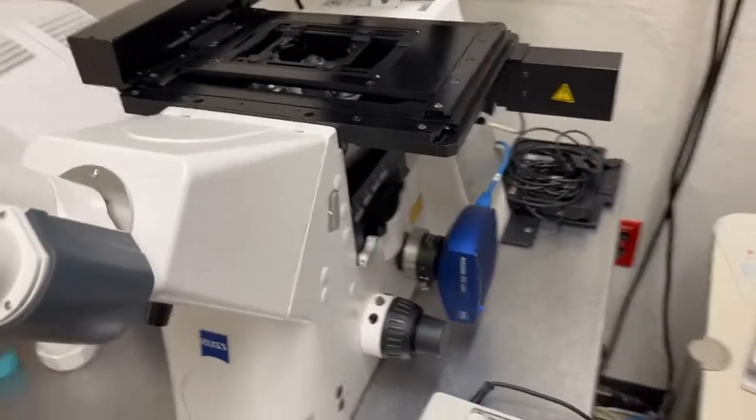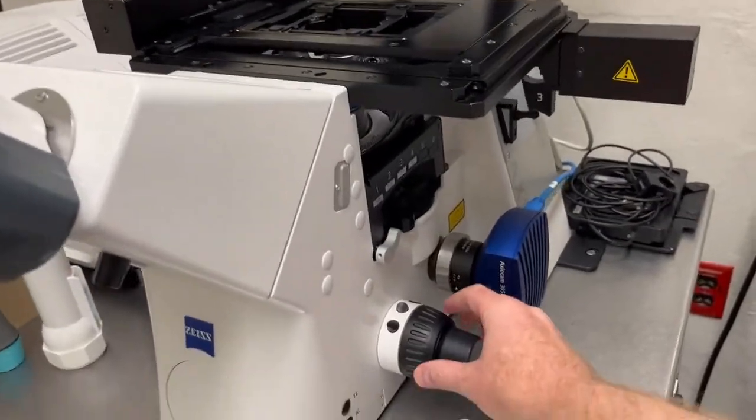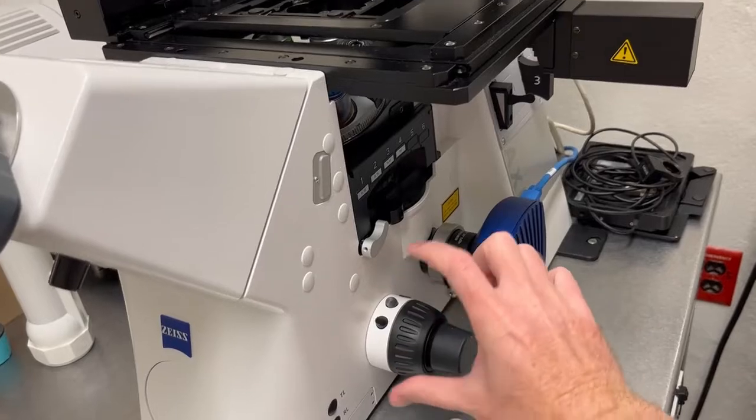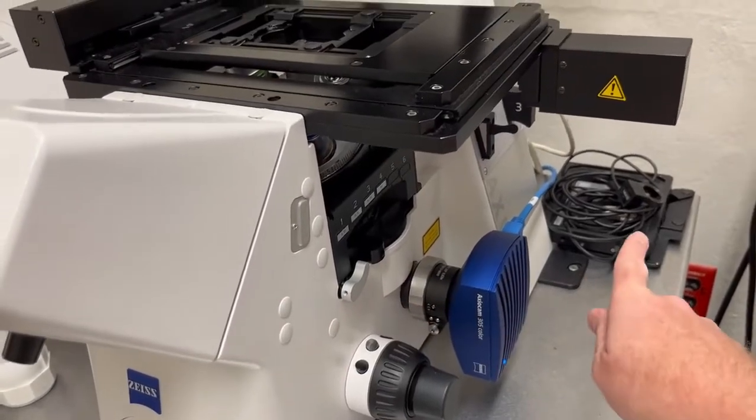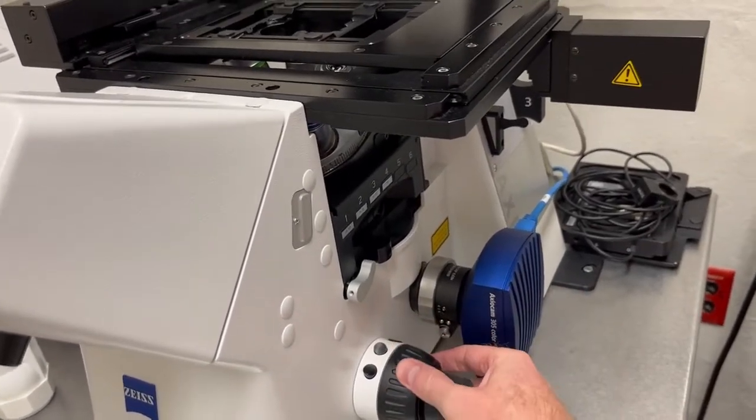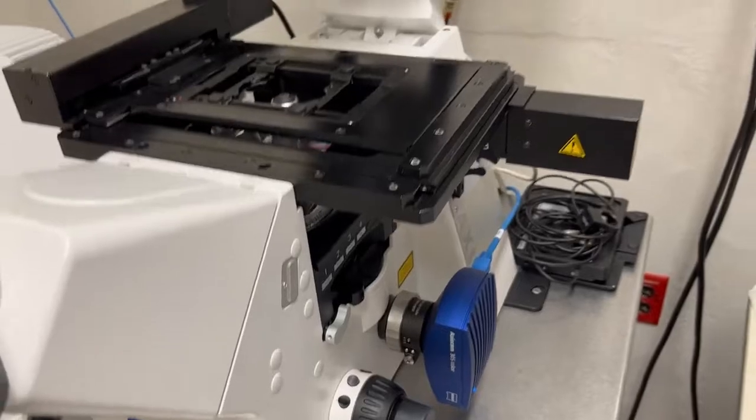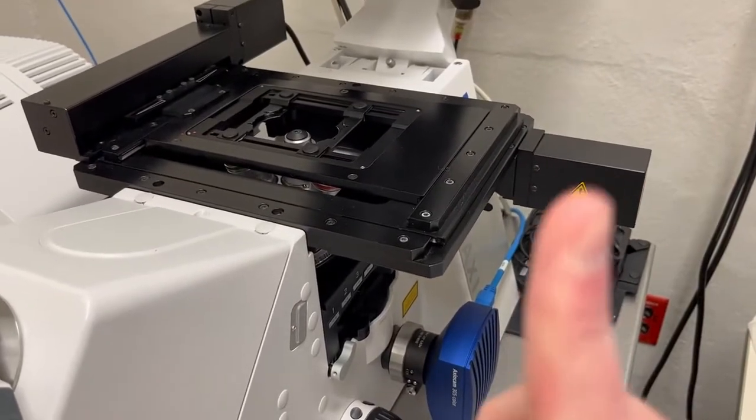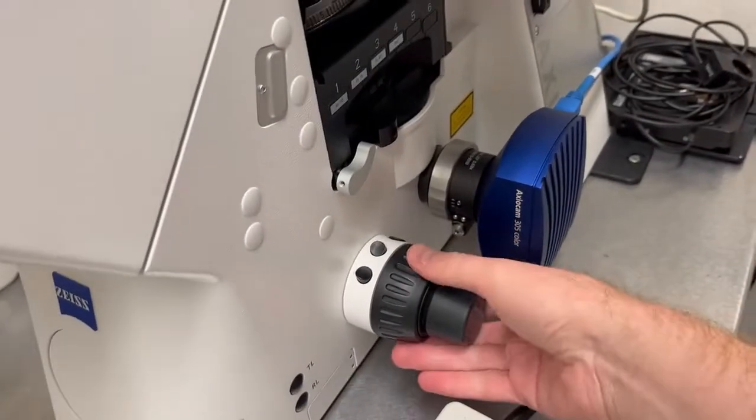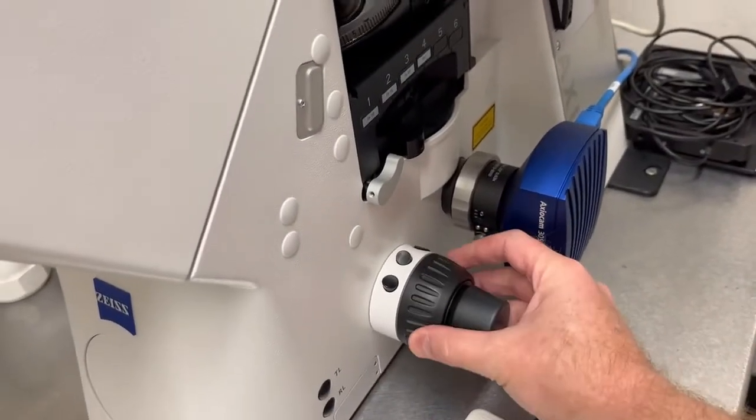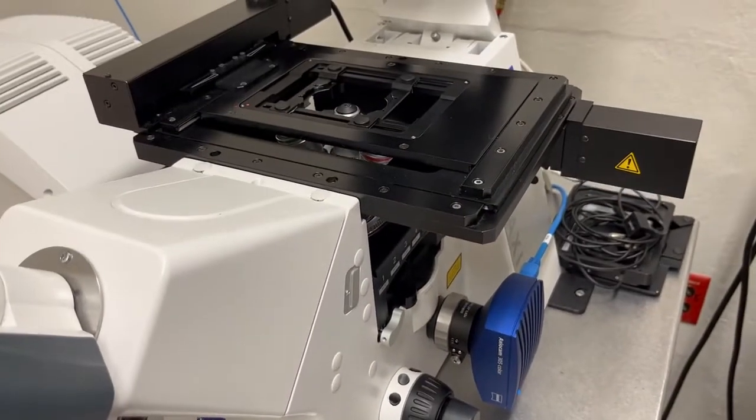This is a German microscope. German microscopes, when you turn the focus knob away from you, so towards the wall, like this, that moves the objective up, whereas when you turn this towards you, that moves the objective down.